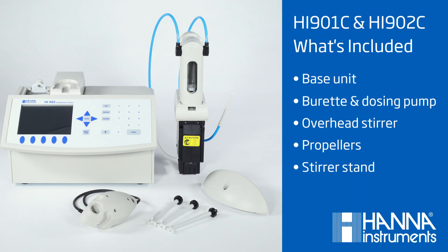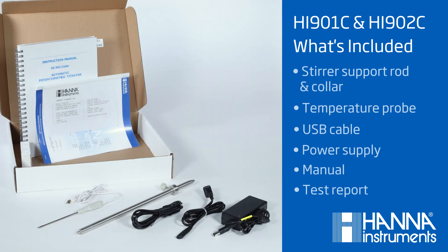When you first receive your titrator, you'll get the base unit, a burette and dosing pump, an overhead stirrer that also holds the temperature probe and electrode, the propellers, and the stirrer stand. In this smaller box, you'll get the stirrer support rod with collar, a temperature probe, a USB cable, the power supply, manual, and test report.